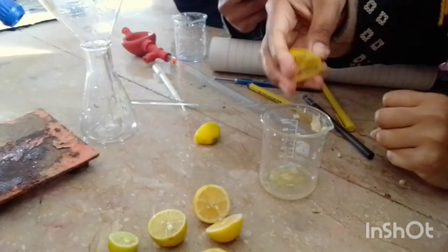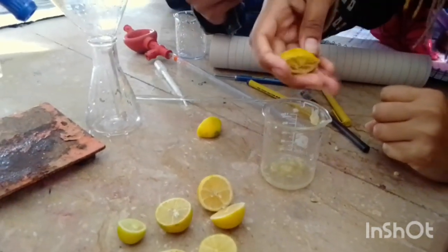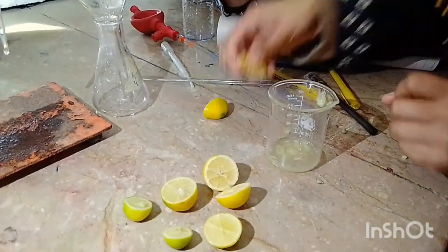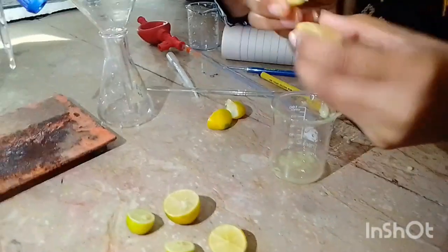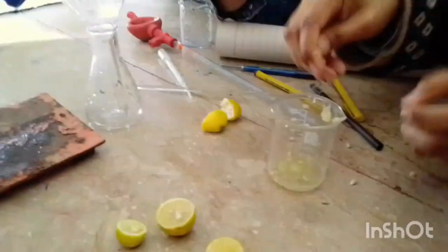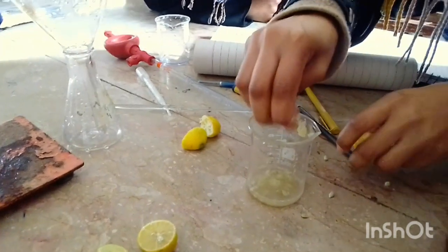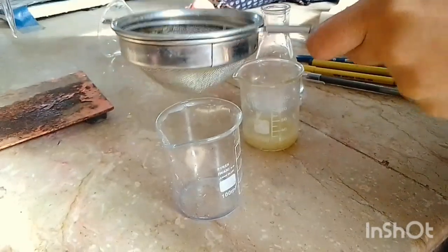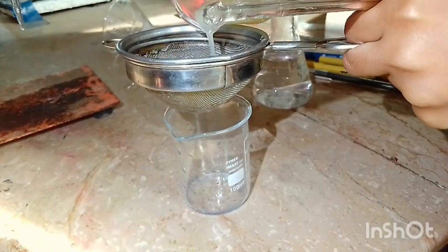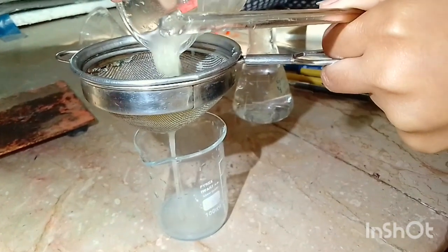We are still getting the lemon extract from the fresh lemons. It's not a very lengthy process. Now we have a strainer because we don't need the pulp — we just need the extract.